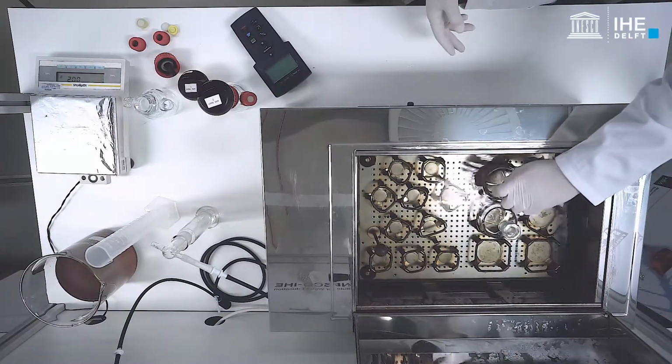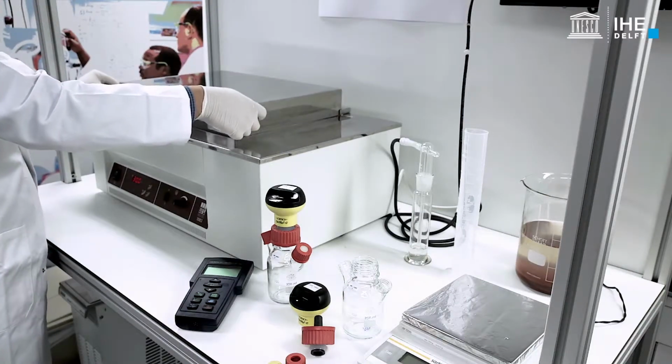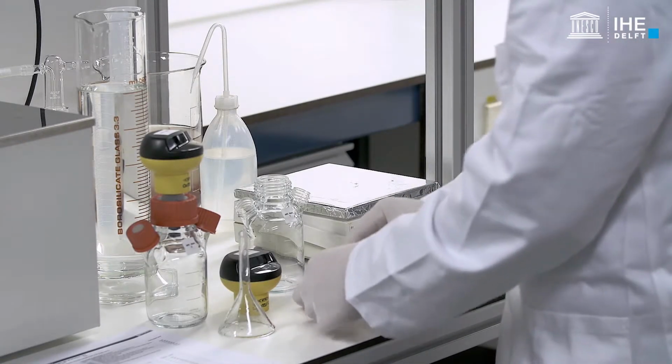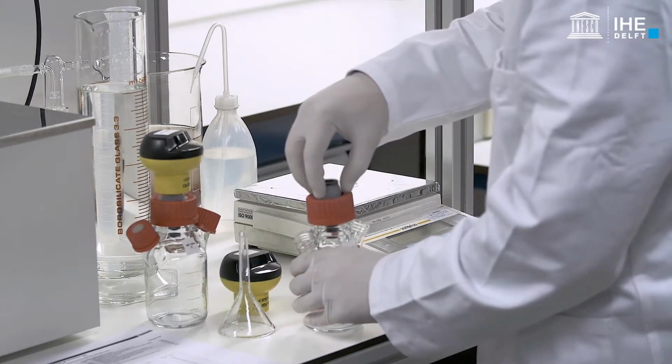The working solutions can be placed in the water bath to ensure that their temperature is similar to the one set for the conduction of the batch test. The actual working volume of the batch reactor can be determined by filling it up with water and measuring its weight.